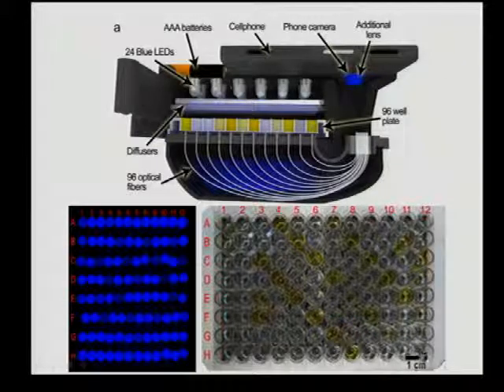Of course, as you can see here, the size is very large. It's a few centimeters by a few centimeters. Typically, clinical instruments use a scanner and have a scanning optical system to look at these individual wells one by one. We've created a system that is based on fiber optics and using the cell phone as an app to acquire these images.